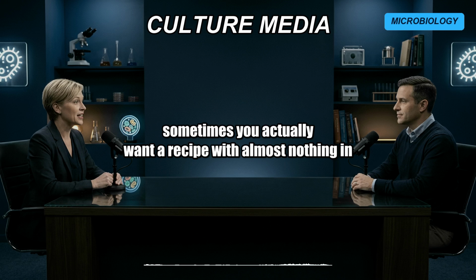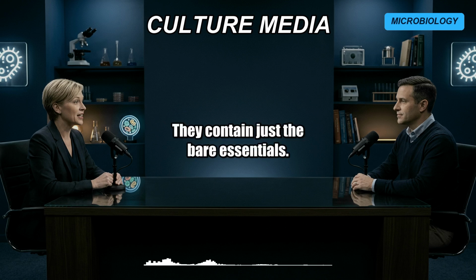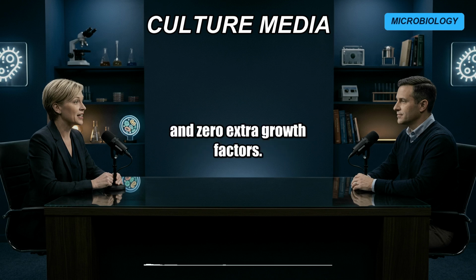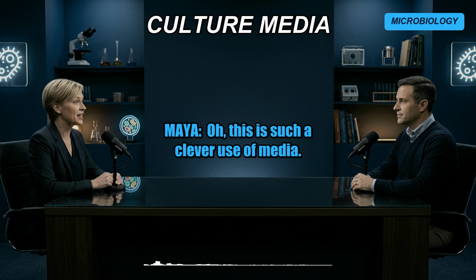But sometimes you actually want a recipe with almost nothing in it at all. Right, stripping it back. Minimal media. They contain just the bare essentials: a single carbon source, some salts, water, and zero extra growth factors. Scientists use it to test mutant strains of bacteria or fungi. Oh, this is such a clever use of media.